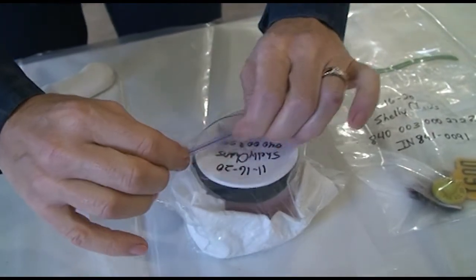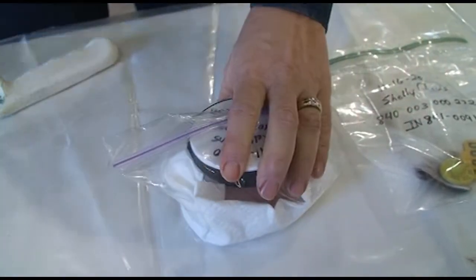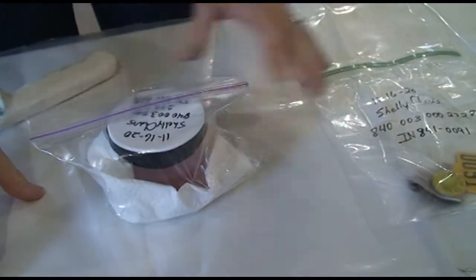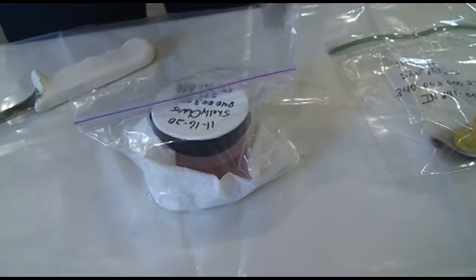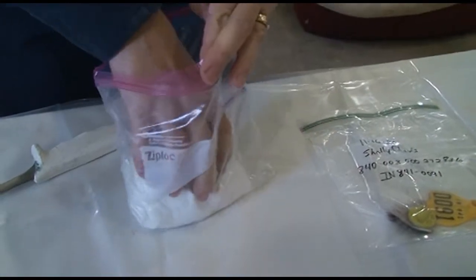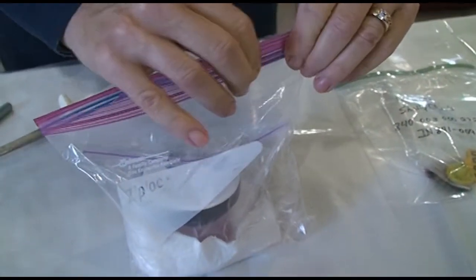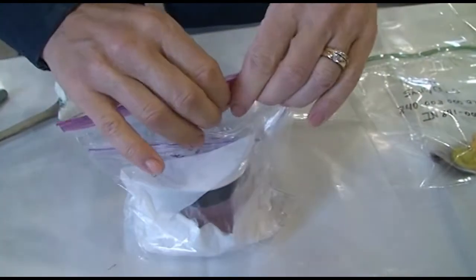Try to get as much air out as possible. And then we double bag it into a second Ziploc bag. And that's how our samples get submitted.